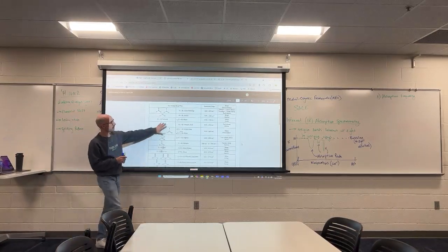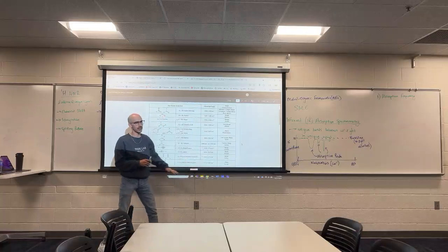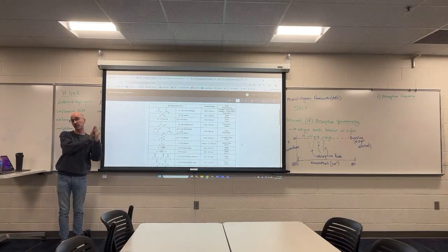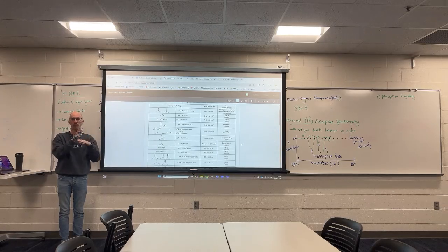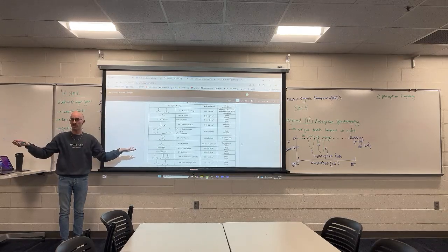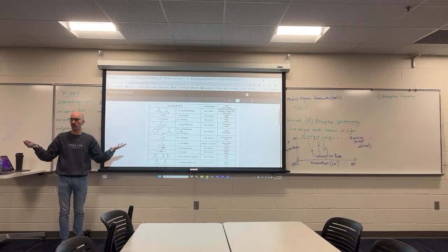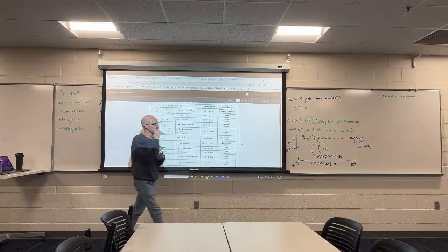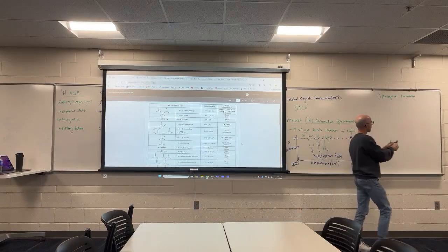You'll also notice then that I put the absorption range. And that's just like what I showed you. I was looking for a CN bond in my pyridine compound and looking at how it had shifted. There's a range where you can expect these bonds to absorb based on the surrounding bonds, the surrounding chemical structure. The exact energy of a specific bond can change. So the exact frequency that it can absorb can change. So we look at absorption frequencies.